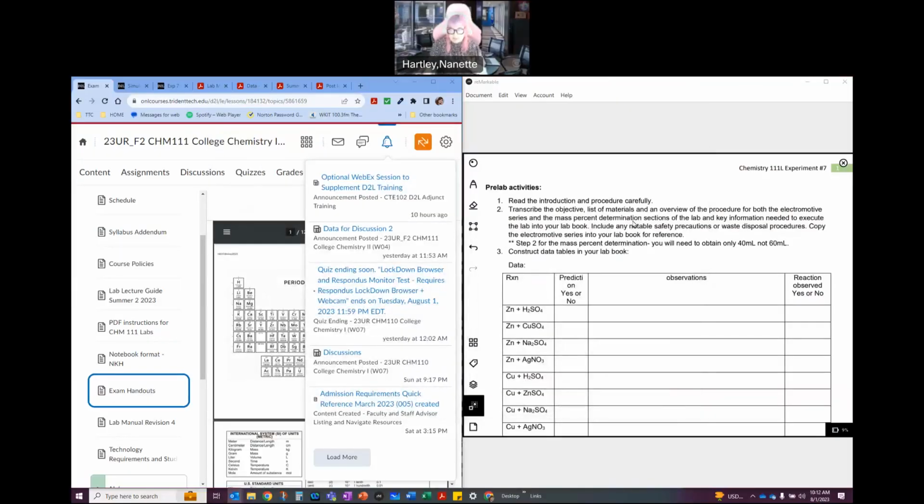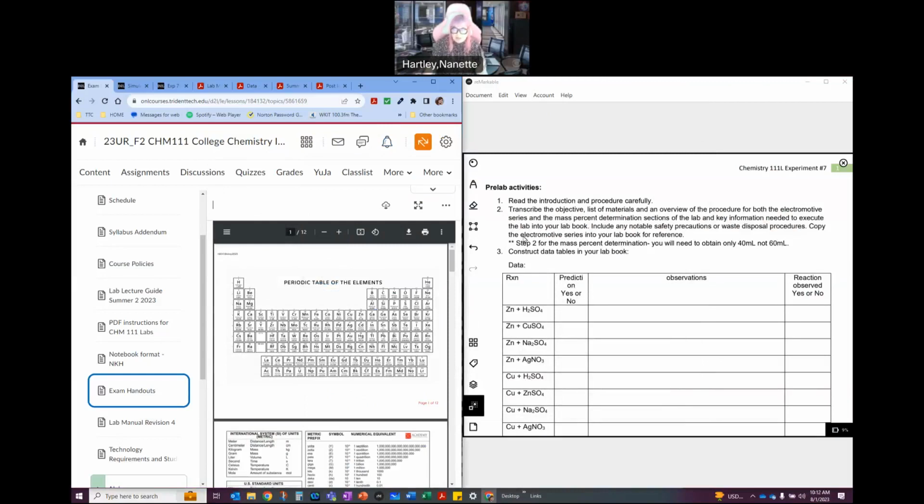The way that I'm going to do this is to go ahead and share my screen and we'll talk about experiment 7. Now experiment 7 is 2 parts. The first part of this experiment, we talk about the activity series. In the second part, we talk about a redox titration, so oxidation reduction reaction titration.